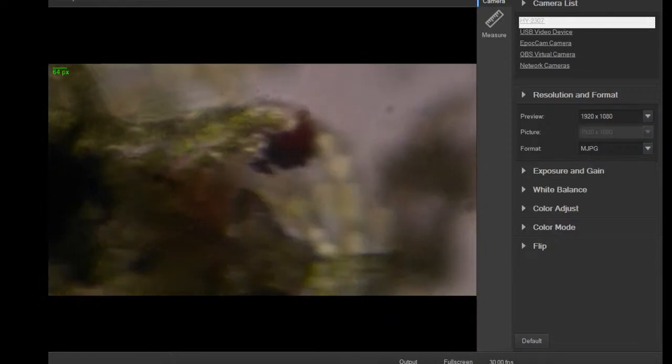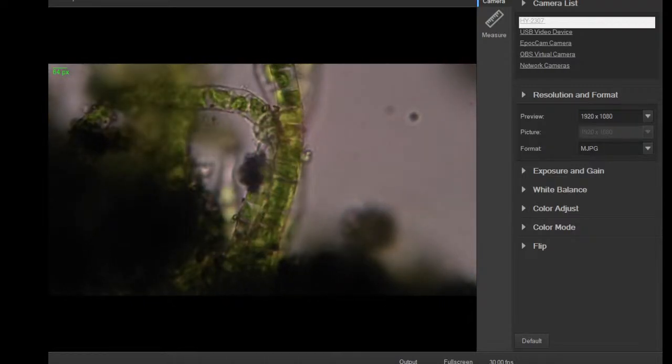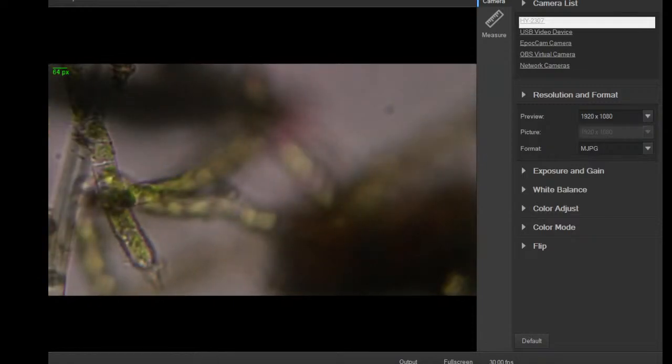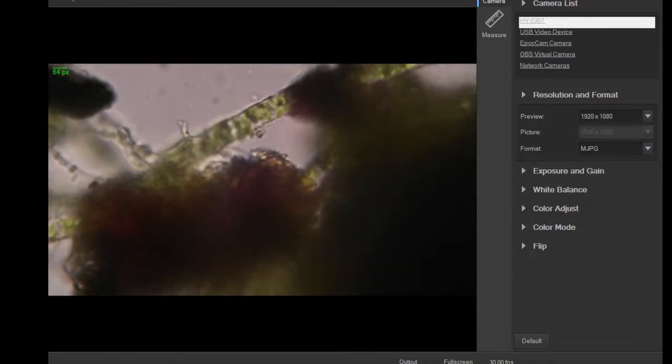Certain kinds of algae you can actually see the chloroplast streaming around inside the cell. It's pretty cool. I'm not seeing any of that in this guy. They don't all seem to do that. There's that little guy going through the forest. Underwater forest.